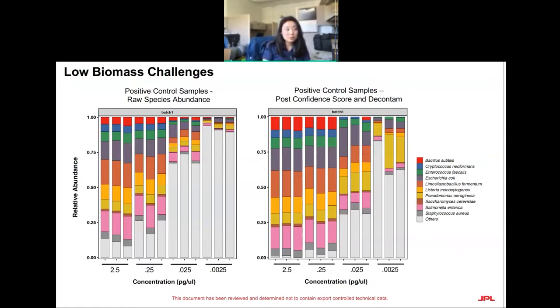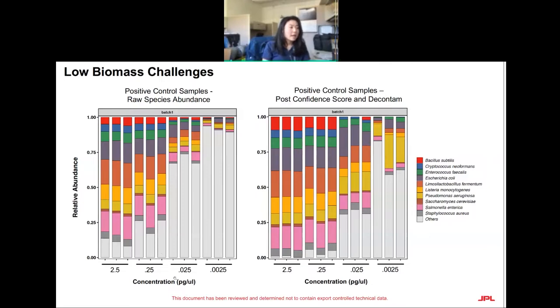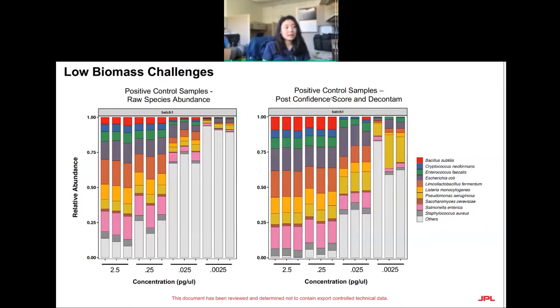We also sequenced a lot of positive controls — a Zymo mix of about 10 bacterial and fungal species. Looking at raw species abundance without any confidence score or decontam, as concentration decreases into the sub-picogram range, your sample is overwhelmingly no longer what you expect. However, when we applied the confidence score found through simulated metagenomes and decontam, at least at the highest concentrations, we were able to really minimize the species we did not expect to find.